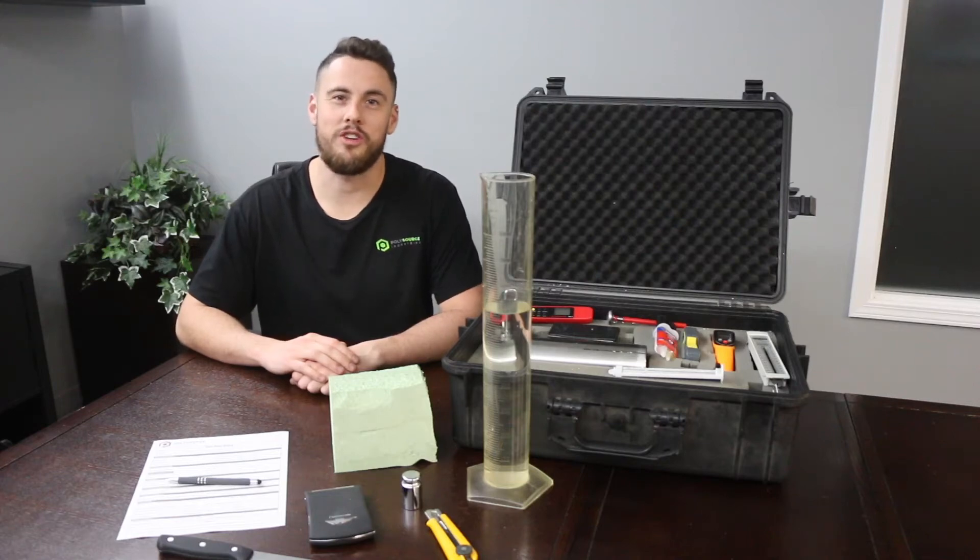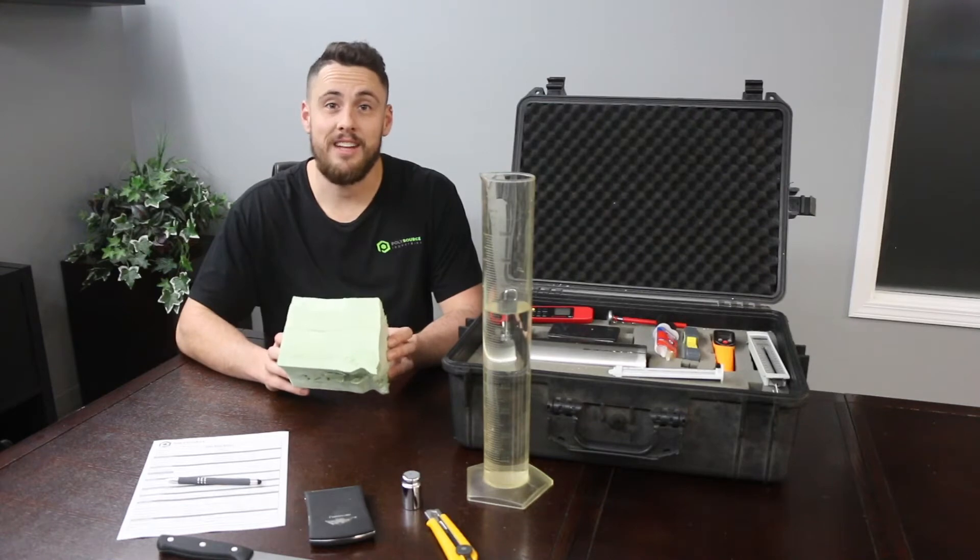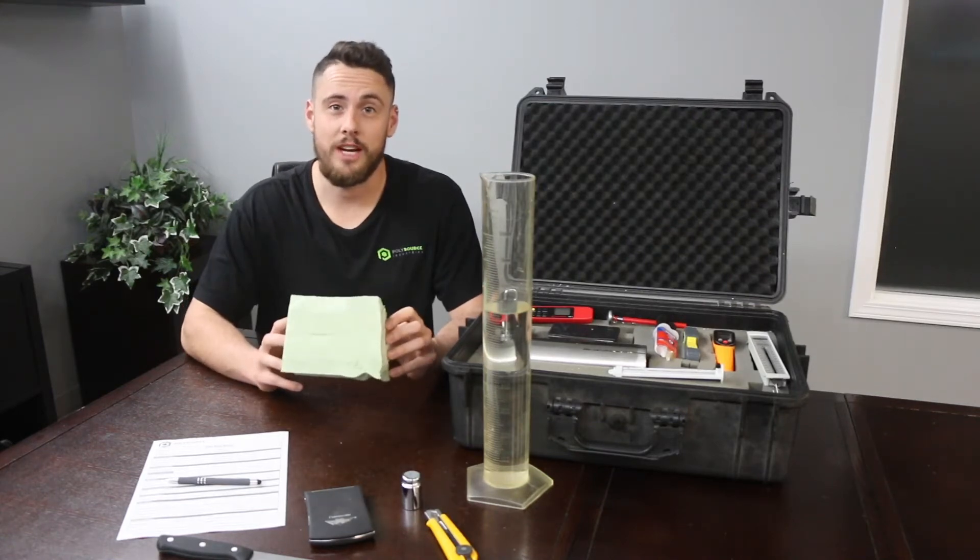Hi there. Ben Porter with PolySource Industries. Today we'll be taking a spray foam sample, checking its density, its adhesion, and its cohesion. First, let's start with the density check.